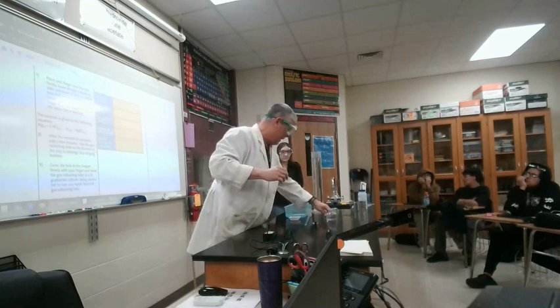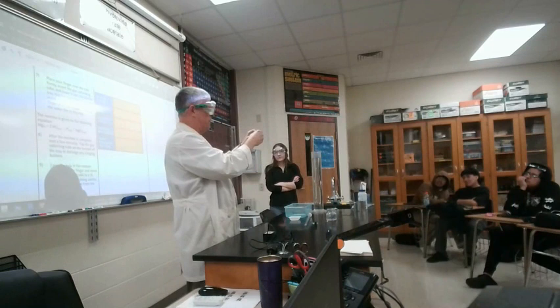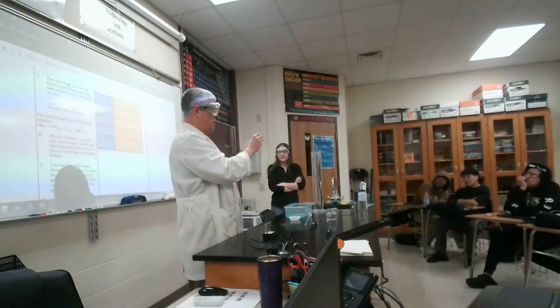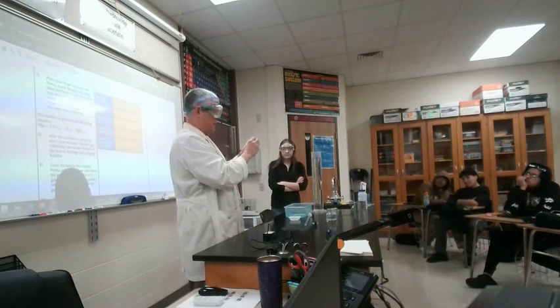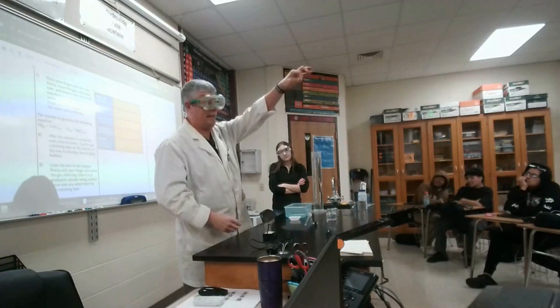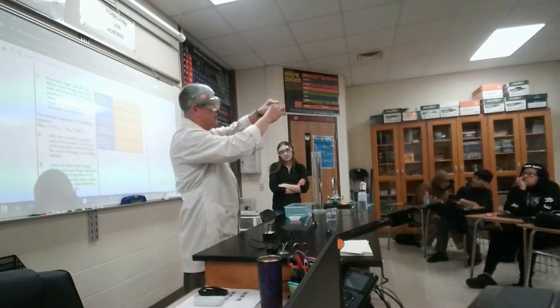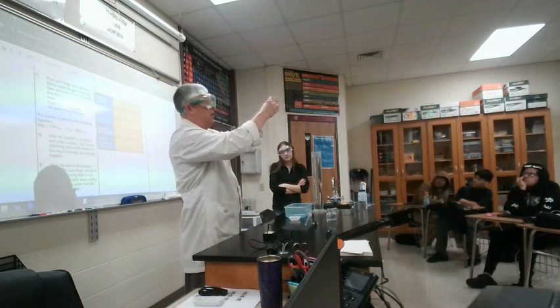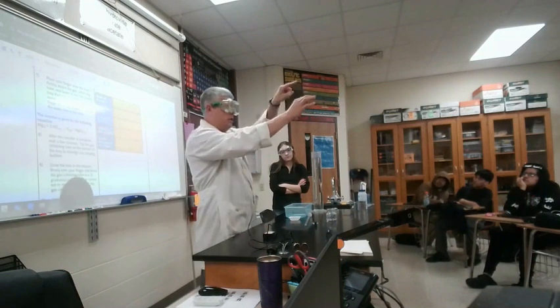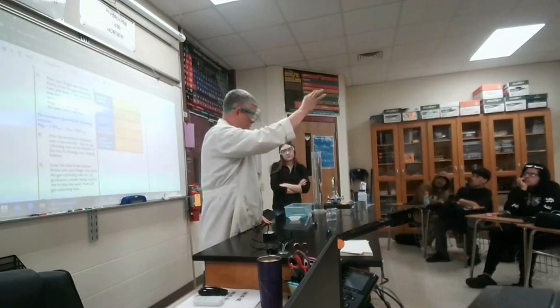Now I'm going to take this piece of copper wire and put it through the magnesium, and wrap it around the magnesium in some way so that it is held in place. Just like that. At this end, I'm going to make a little hook shape on it. This is now ready to go, but I've already found the mass of this. Questions?